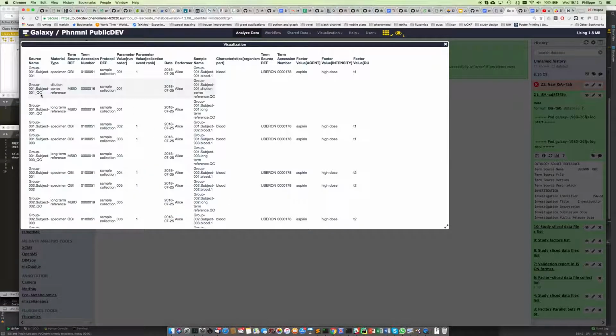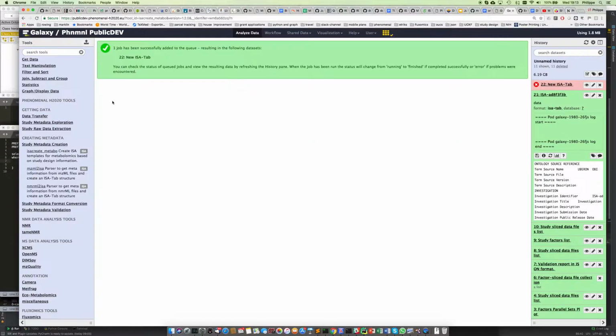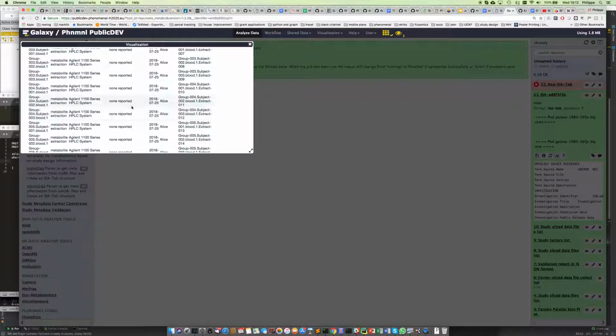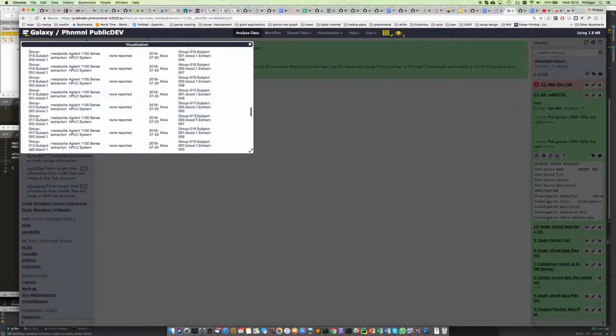If you want to have a look at the samples, here is a rendering of the table. You can see how the information is regularized. You can see the ontology annotation showing up, but also the way the sample annotation has been structured. You have the QC injected here as planned. We can again reactivate the visualization component, and if you want to see a bit more about the assay table, you have this functionality available to you there.